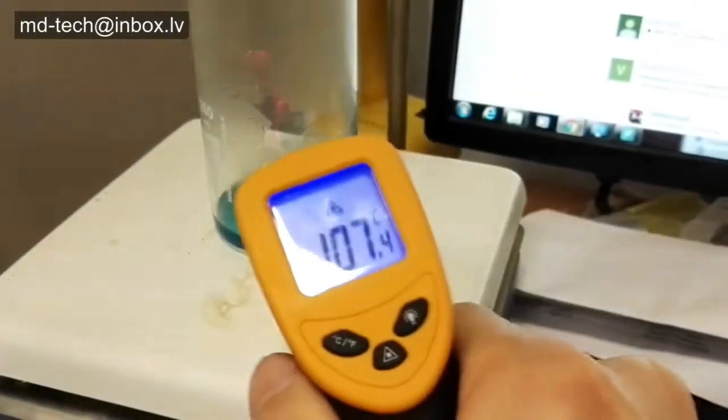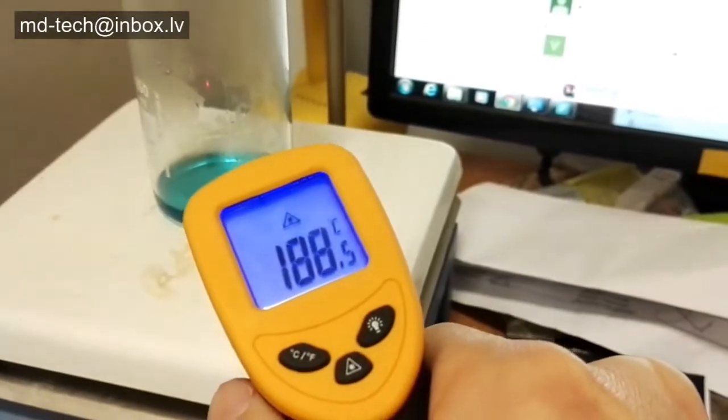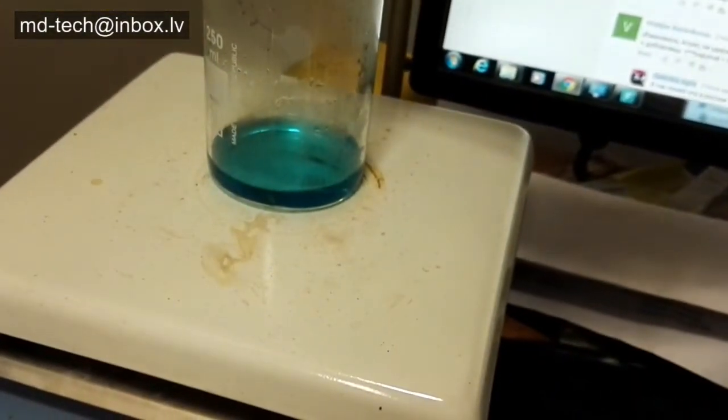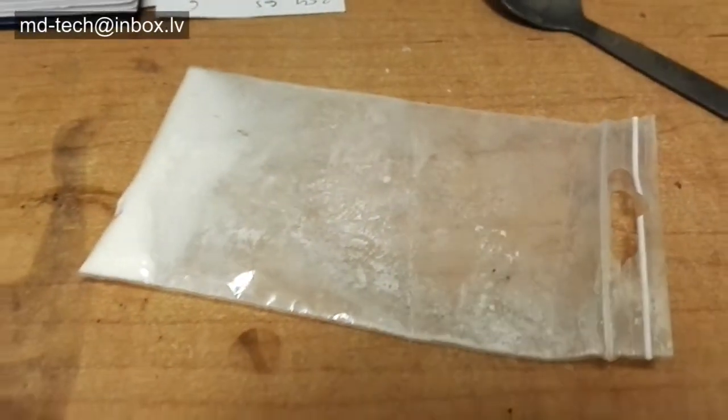When I place the beaker on the hot plate and boil, I put in 4 grams of ascorbic acid. Copper nanoparticles form slowly. Full precipitation needs 1 hour.